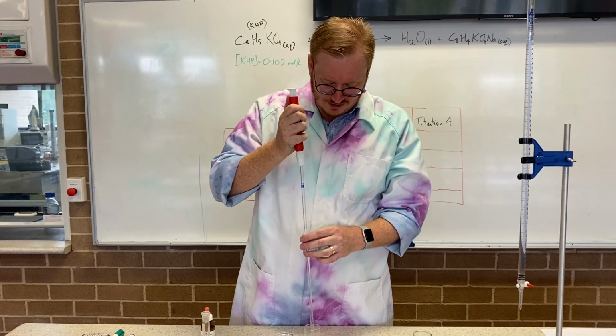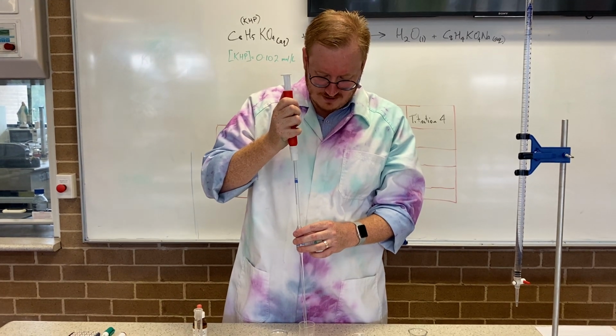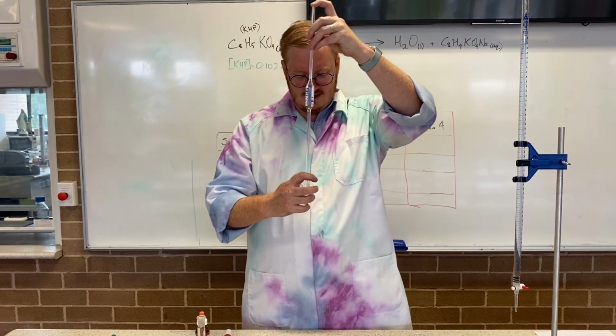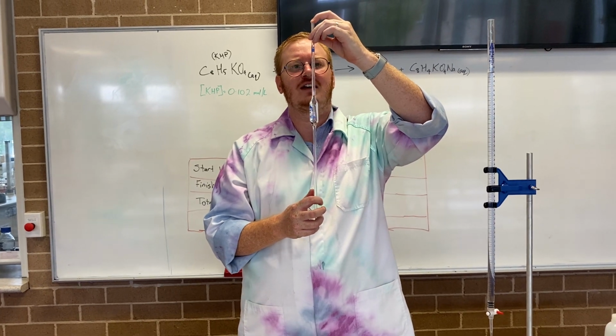One of the most common mistakes that I see in assessment tasks is people not labeling their glassware and not distinguishing between what the acid and base is. And so they get to a problem where they've done a titration and they've gone through 50 ml and they've seen no color change.